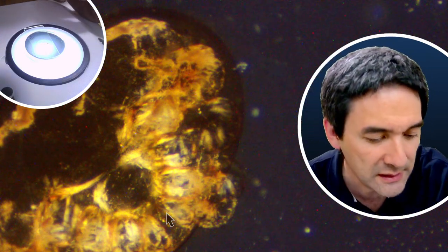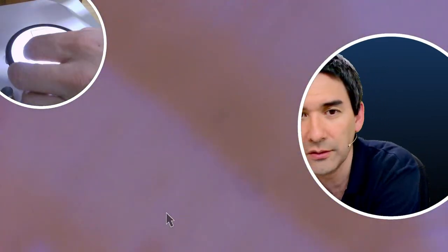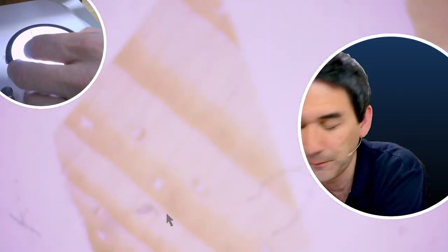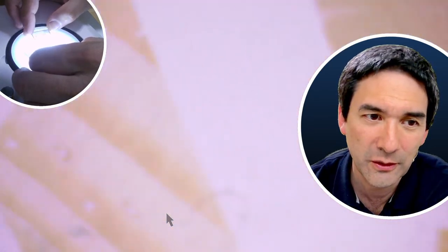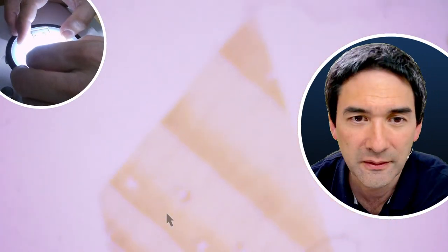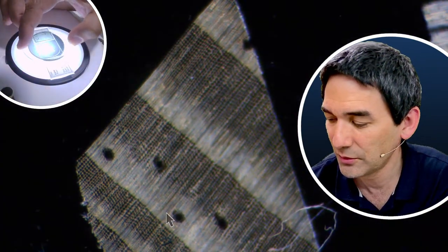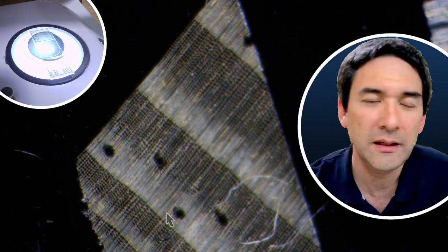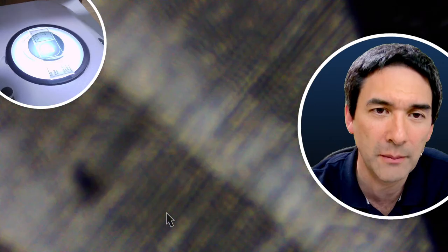And last but not least, another thing here, and that is wood. It's also one of my favorite specimens. And this wood over here, always zoom out again. Let's try to find the, I'm also moving out of the field of view. So that's the one. There are actually three samples on this slide. Okay, so let's place it on top. And I think here the wood simply completely depolarizes the light, and that's why it appears bright on a dark background.